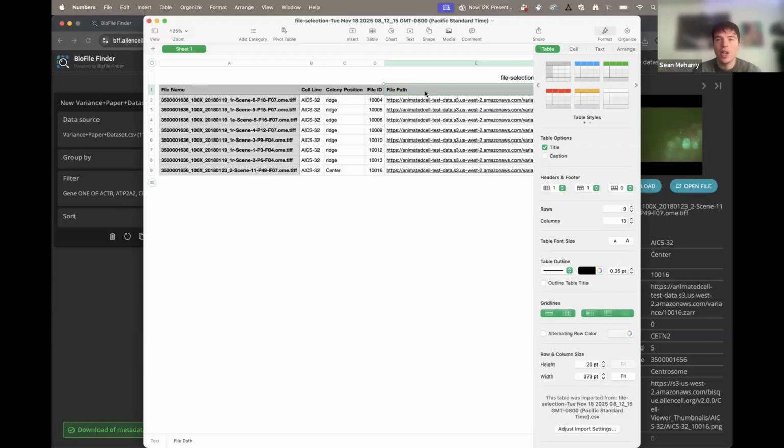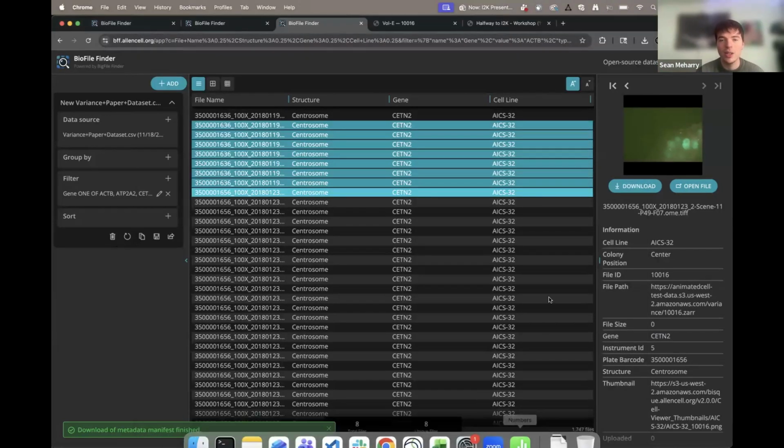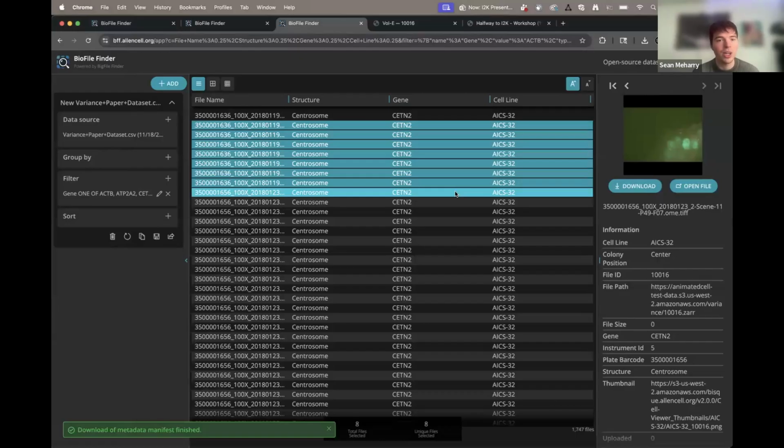So if you do have it in a hard drive in a closet somewhere, totally unconnected to your computer, you won't be able to view it, but you would be able to view the metadata, which is what BFF displays in here, because that is what is in your data set. So it's a way of sort of cataloging your data regardless of actually being able to interact with it. So you don't have to rely on your folder structure within your own file system.